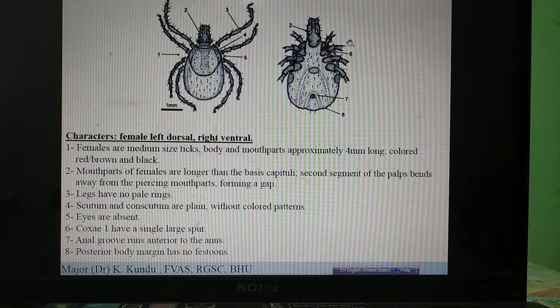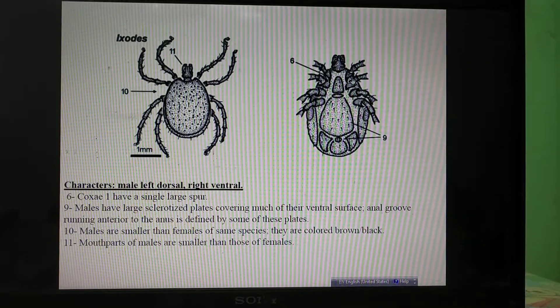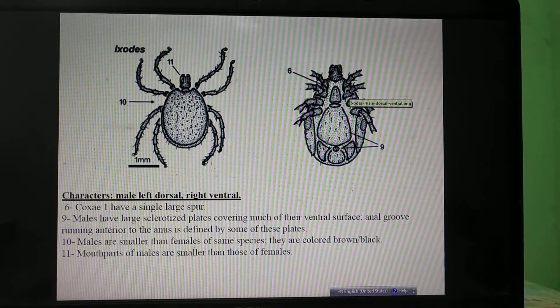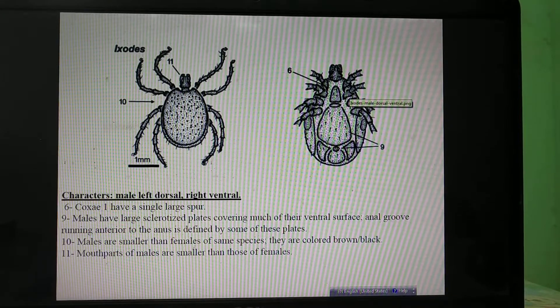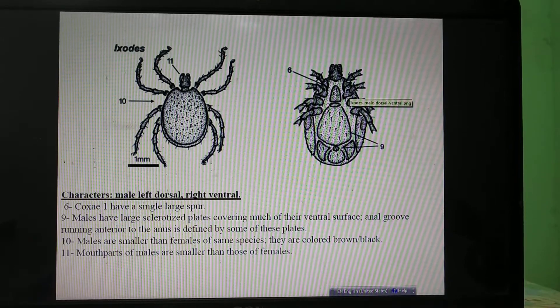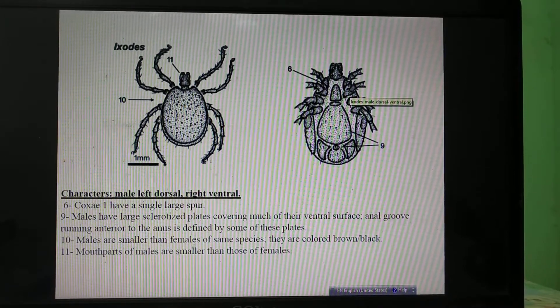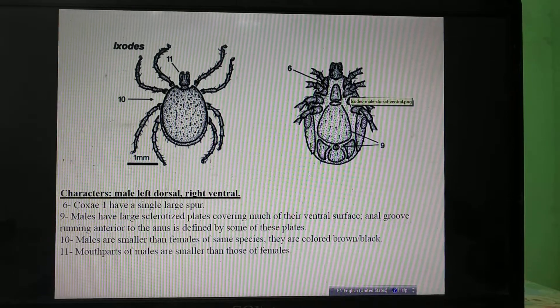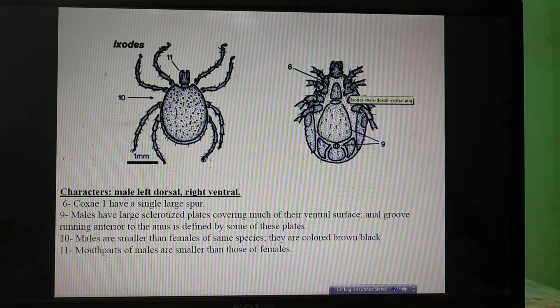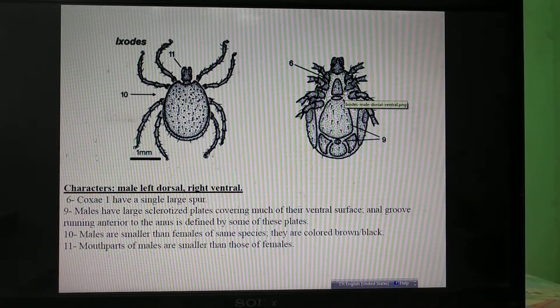There is also a large spur on the first coxa. To revise: the most important character of Ixodes is that the anal groove is anterior to the anus. In males, the entire ventral surface is covered with thick sclerotized cuticular plates. The first coxa has a single strong spur.